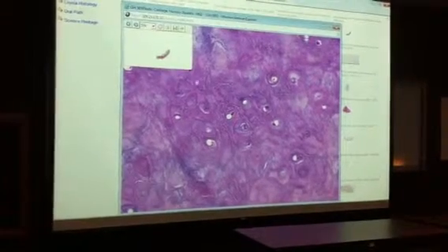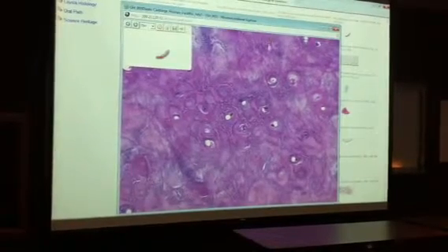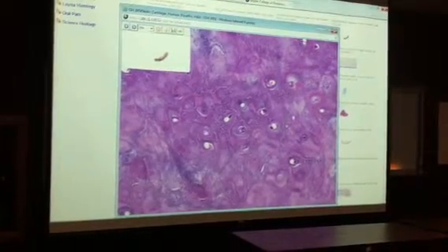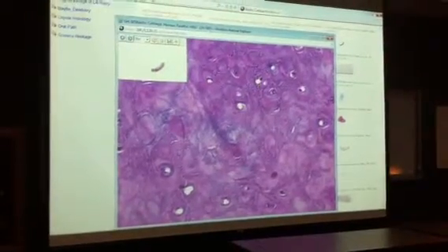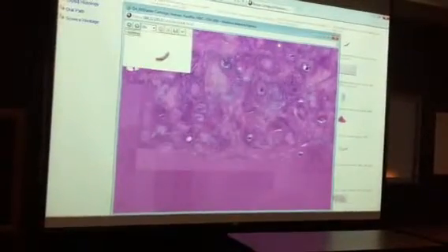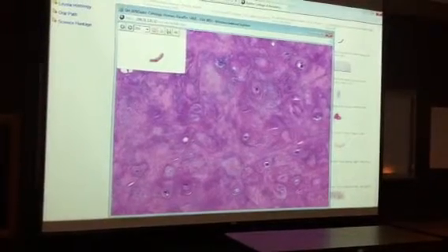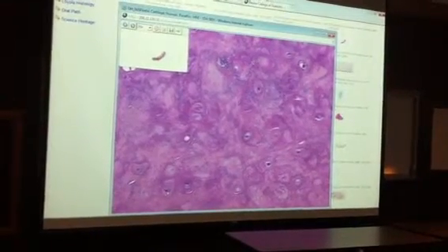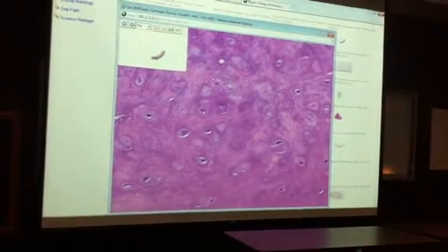that's elastic cartilage. It's not hyaline because you can see all these elastic fibers and other things that are present inside of it. It still has chondrocytes sitting inside lacunae. It will have isogenous groups. When you look around, do you see many isogenous groups when you're looking around through this? I mean, you really don't. When you saw hyaline cartilage, it was loaded with isogenous groups. This doesn't have anywhere near the number of isogenous groups in it. Okay? There's all those fibers inside of it.